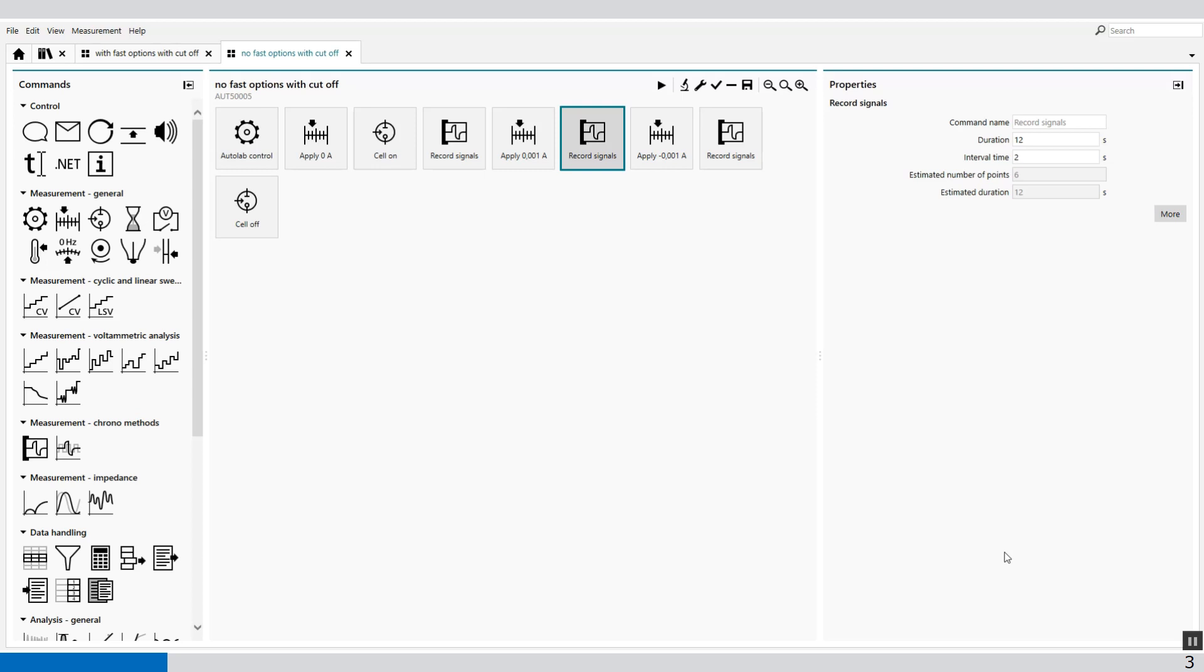For example, if we look at NOVA, the duration of this procedure is for each record signal 12 seconds and the interval time is 2 seconds.